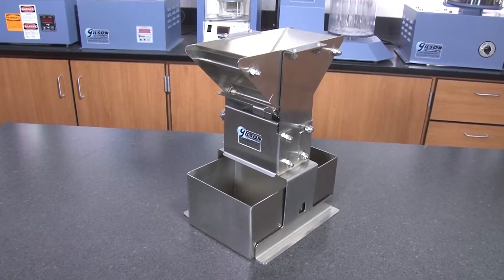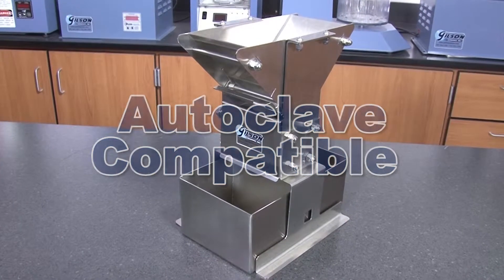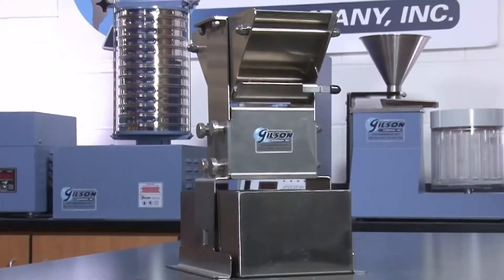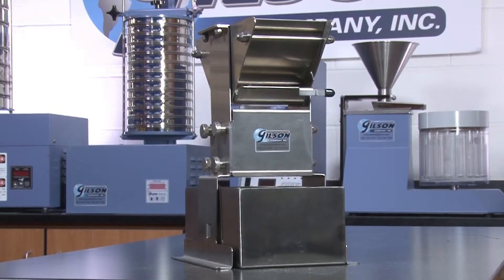All parts of the Gilson Precision Splitter can be autoclaved for maximum protection from contamination, making the Gilson Precision Splitter the right choice for your representative sampling needs.